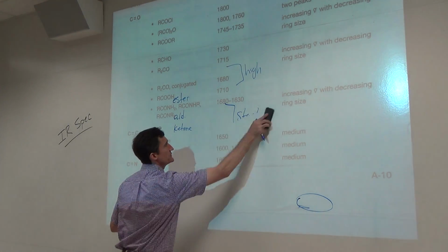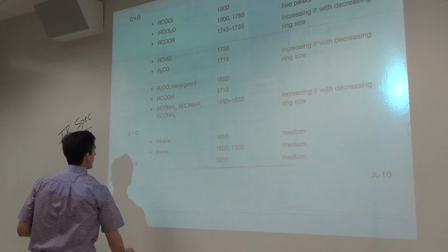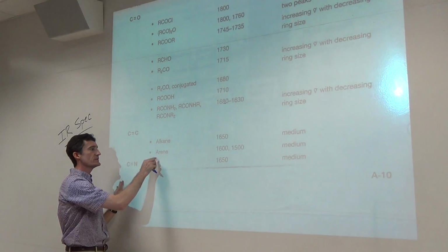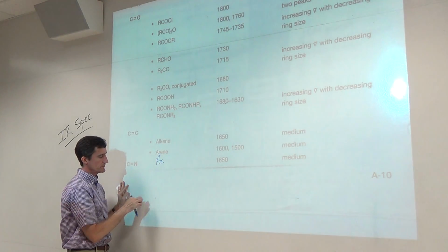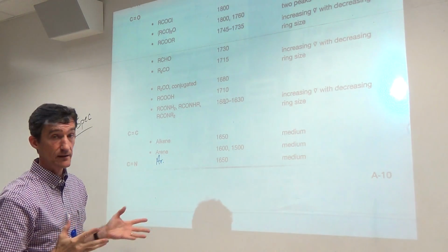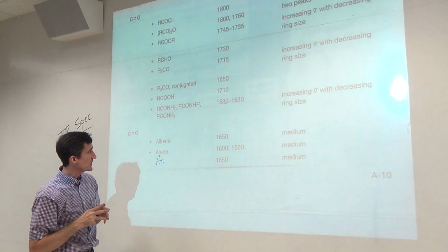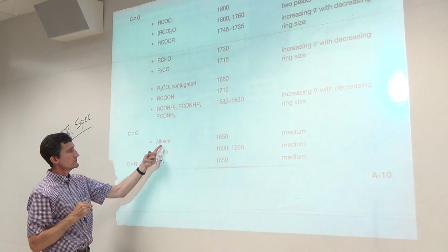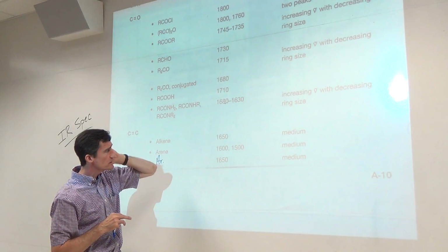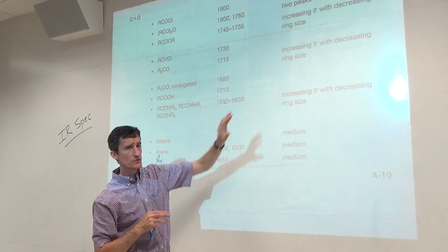Also in the double bond region, you have our C double bond C. These can be in alkenes or also arenes. Abbreviation for that. Typically AR, a term that I use more often would be aromatic or aryl. These authors chose to go with arene, probably to make it similar to alkene here. Similar range, typically lower than carbonyl. Usually not quite as intense as carbonyl.